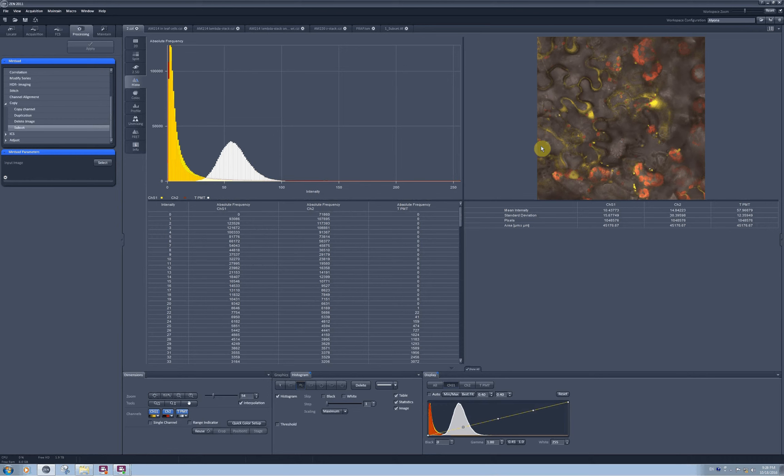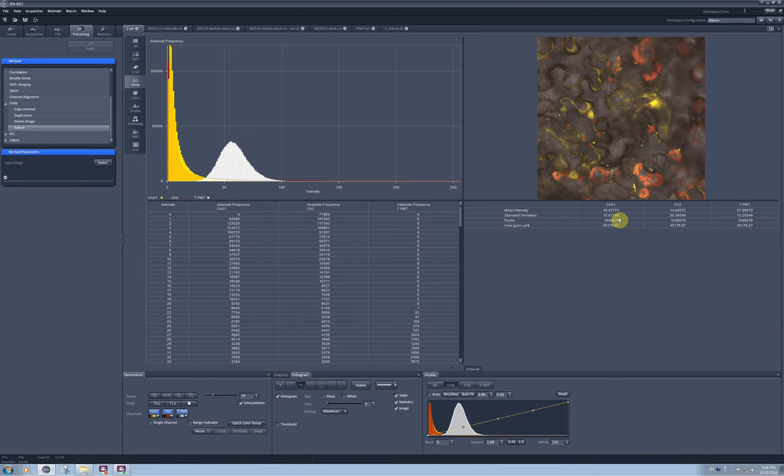Since nothing is selected on the image, the software automatically quantifies the whole frame. Now I can see mean intensity for the channel S1 with its standard deviation, number of pixels and the area. And the same information for channel 2 and transmitted light TPMT channel.